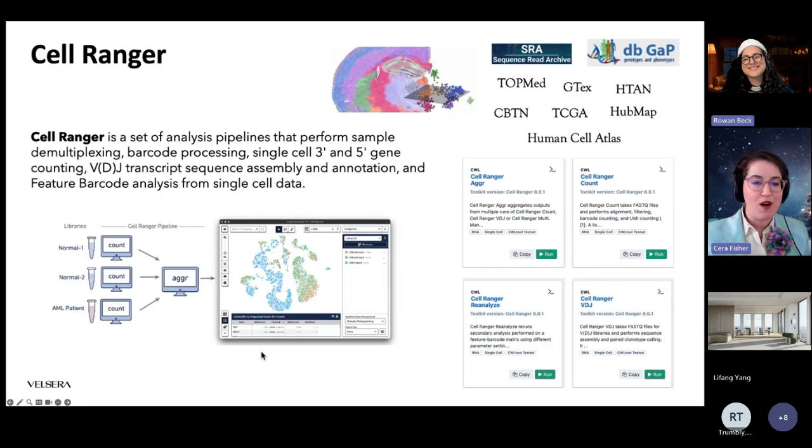Same. So all this newfangled single cell felt intimidating to me. But working with toy data sets, which admittedly tend to be well behaved, I was able to work with Cell Ranger count pretty easily.